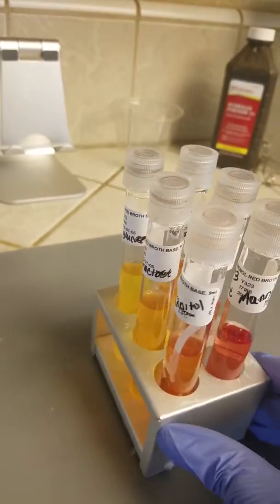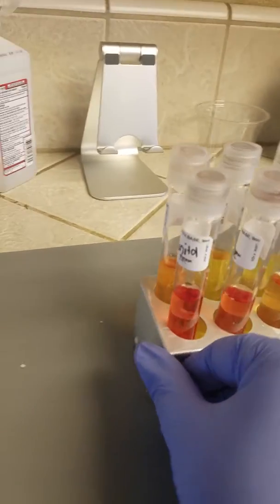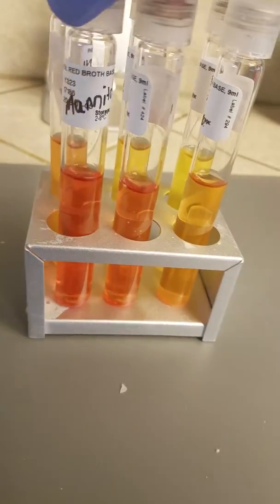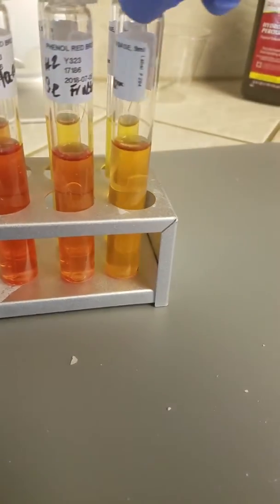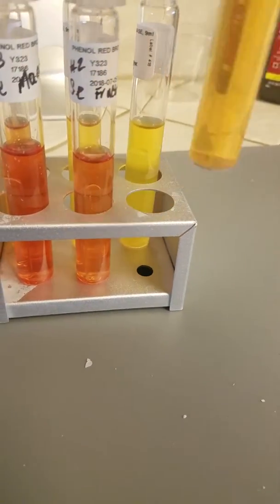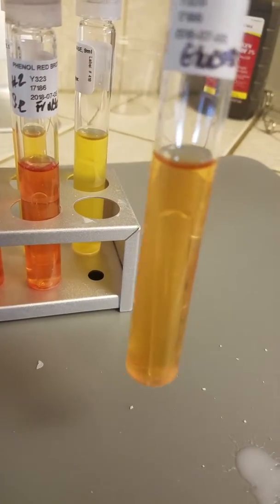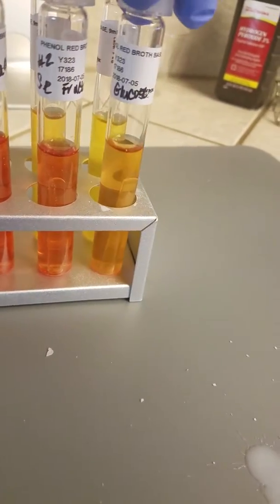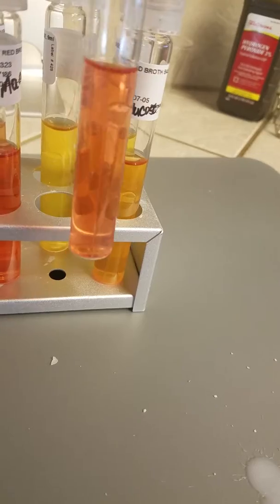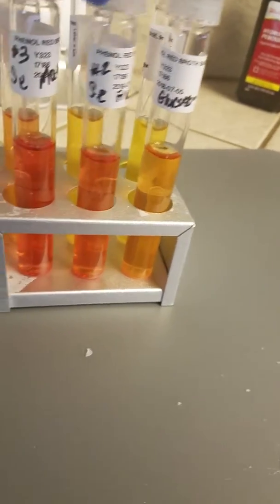And back here is my staph collection. Now as you can see, the glucose here is more of a yellow than the other two here.